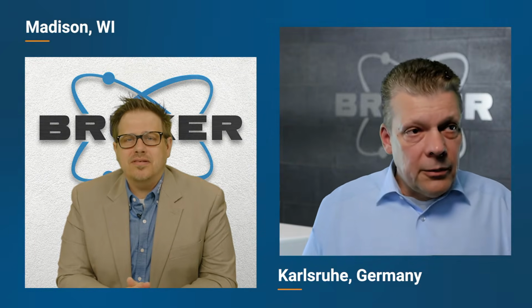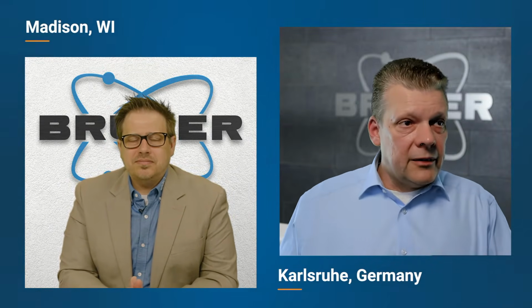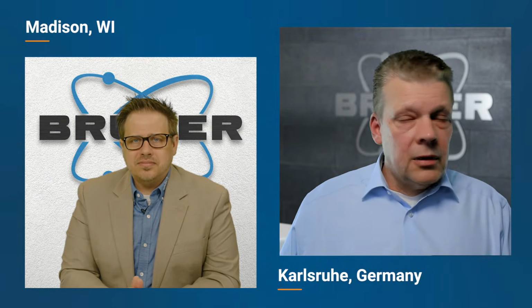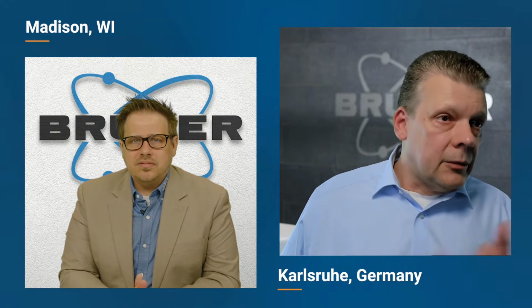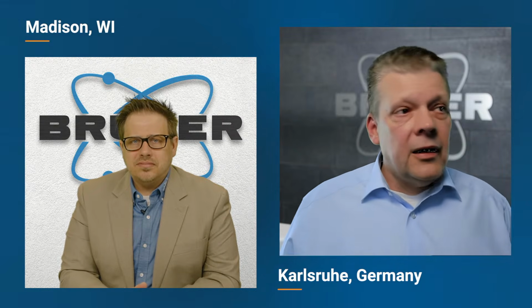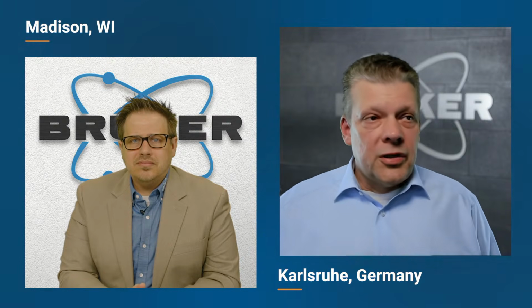You usually go, sorry, I didn't answer the question before. You usually have 10 usual matrices. You have iron, aluminium, copper. Then you have cobalt and nickel. They complete somewhat the iron base. But then you have tin, zinc, lead, titanium, and manganese. Magnesium, sorry. Magnesium as well. That should be 10. And then there are requests, for example, for precious metal bases.